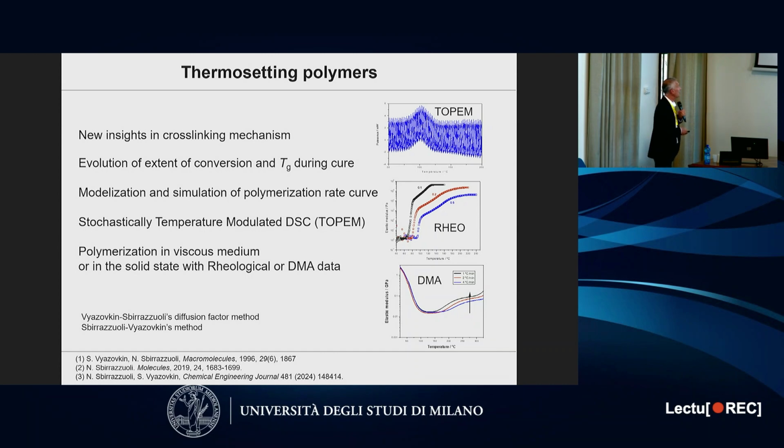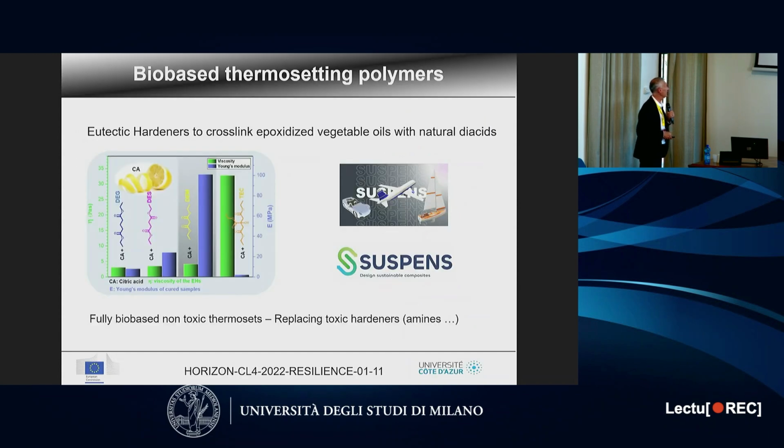So the second application is about thermosetting polymers. Again, the idea is to show that we can obtain new insight in cross-linking mechanism, make some modelization and simulation. And also I have developed a specific method to follow polymerization in viscous media or in the solid state using rheological or DMA data, as you can see here.